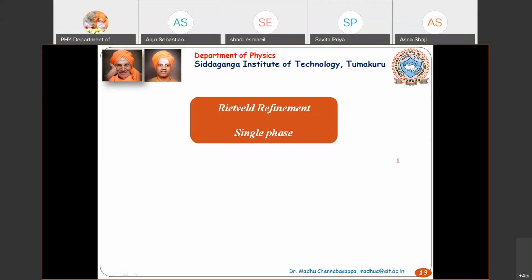Okay, but when it comes to Rietveld refinement, we are going to change, stop it. Okay, so right now when you do a profile matching, you need to change this, or you have to run this 1 for your zero. Okay, so this is necessary for all the materials when you are doing a profile match. Okay, not when you do the Rietveld refinement. So that I will explain again.